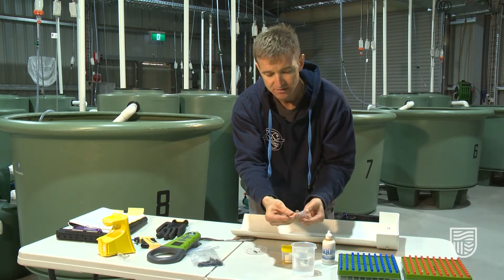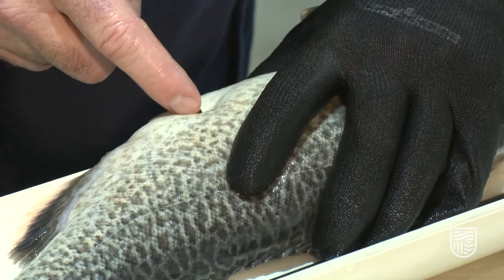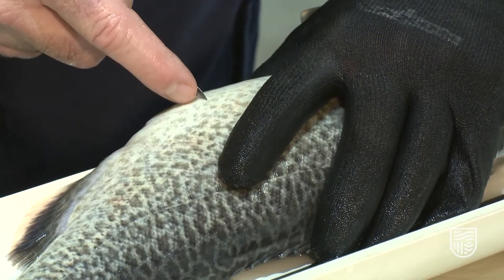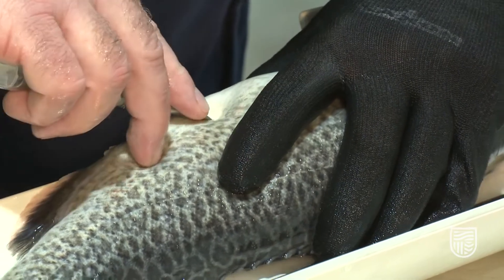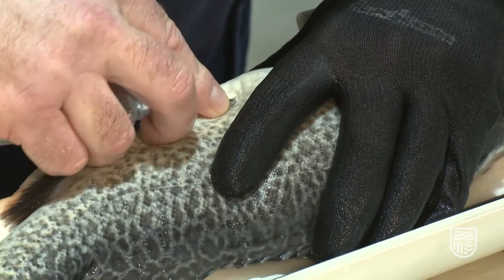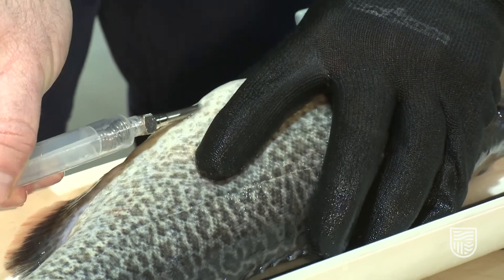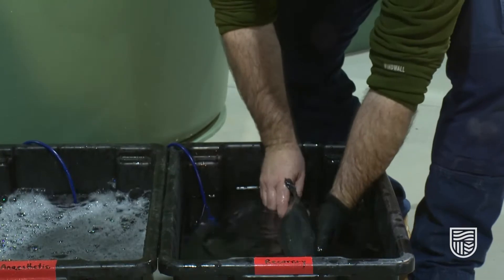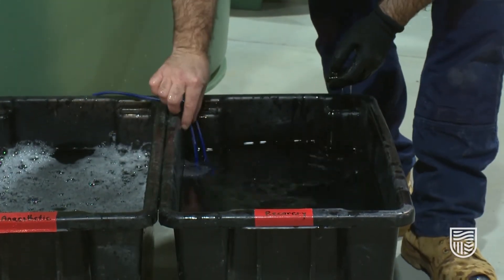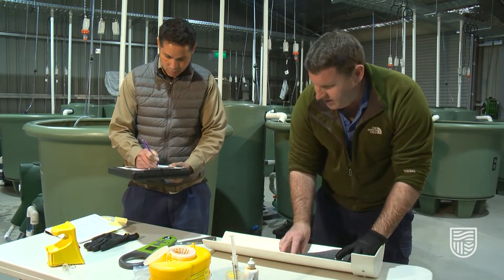We then place the tag itself into the applicator needle, and then the needle is ready for Jared to put the tag into the fish. For fish that have scales, sometimes it's useful to use the end of the needle to remove the scales, just to make the insertion process easier. It doesn't hurt the fish in any way — it's just the same as cutting your fingernail, because scales will always grow back once the fish is healed.